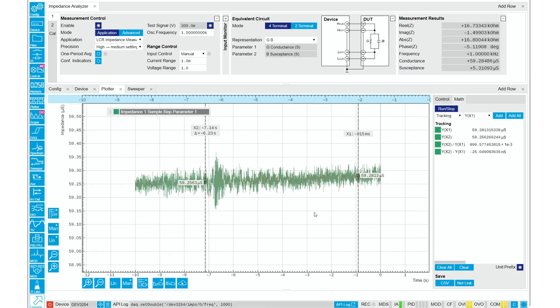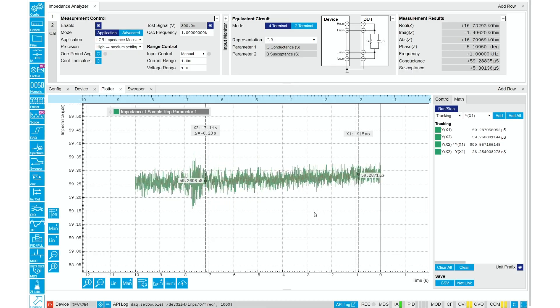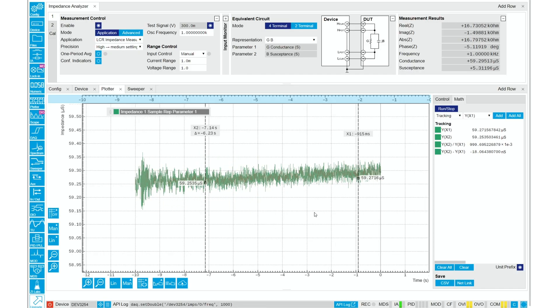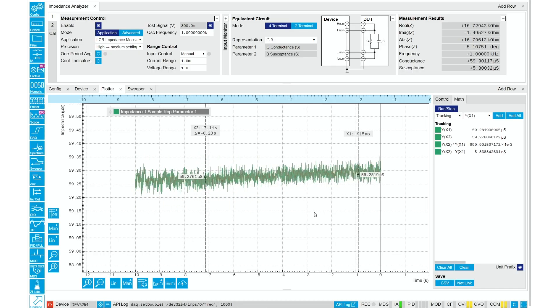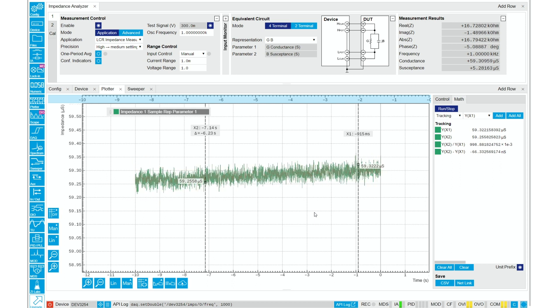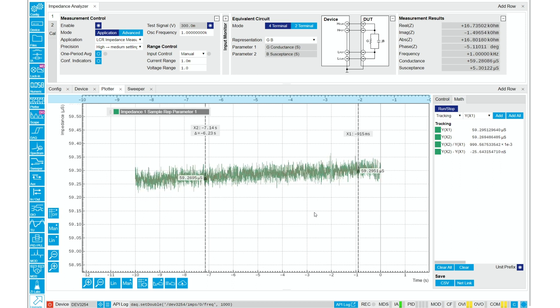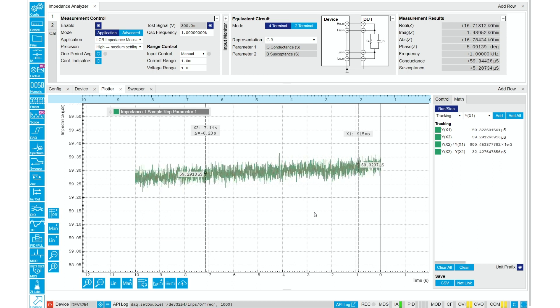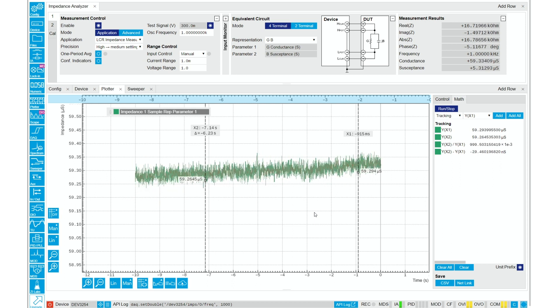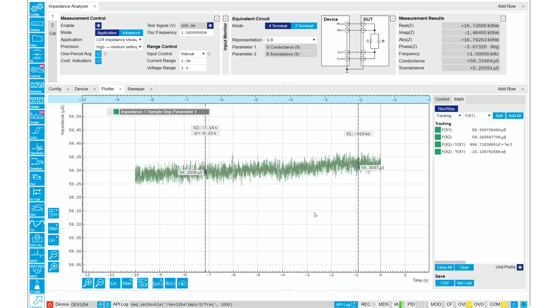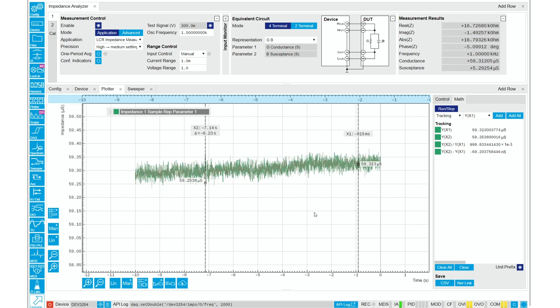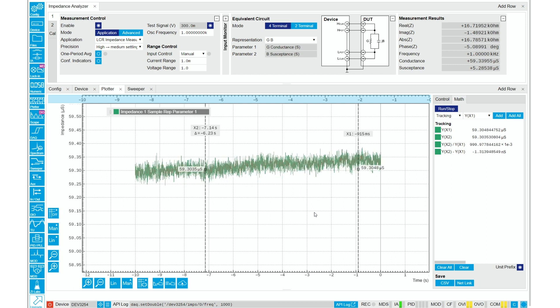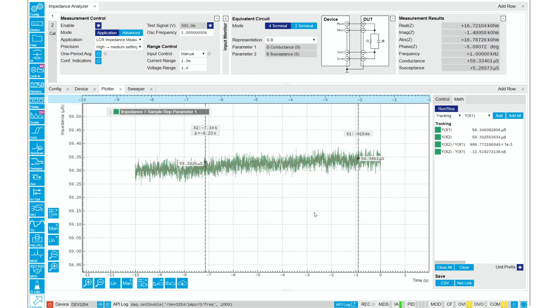A conductivity probe allows us to carefully define the geometry. More specifically, it allows us to define the cell constant, or distance over area at 1 per centimeter, with which we can calculate the conductivity.